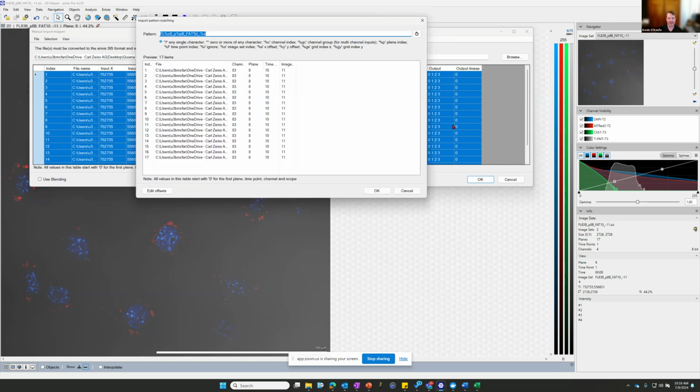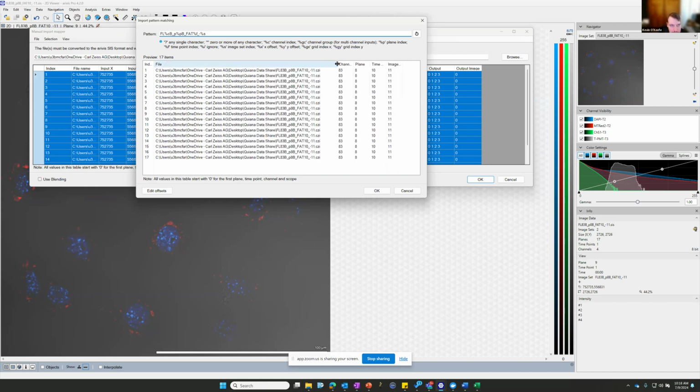Another option is pattern matching. This would be a little more manual way to do the same exact import and reconstruction of the image. I shouldn't say stitching, it's more reconstructing the image. Let's say applying that dimension order is not recognizing it, you can then do pattern matching, where it'll give you a little key for how you should write the data and search the string.